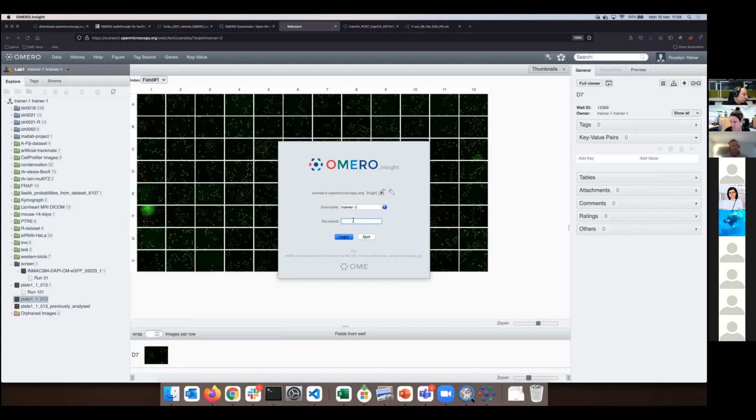And also you want to keep the owners of the data, I mean, every object in Omero is owned by somebody, and their data in the same group. Otherwise, you will get into trouble. But the data will not get lost, and it will be fixed by putting the people into the right containers again. But you have to be a little bit cautious, but it's not rocket science.